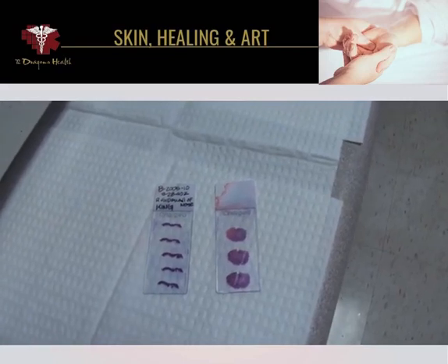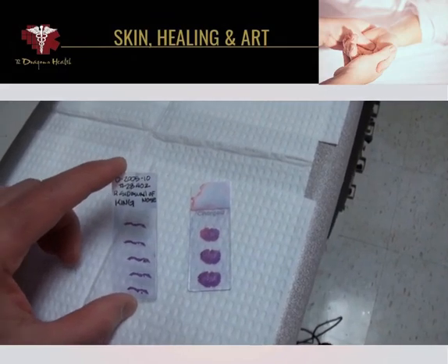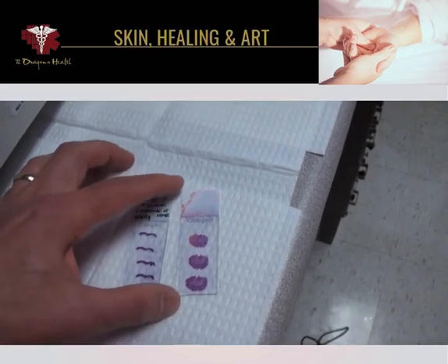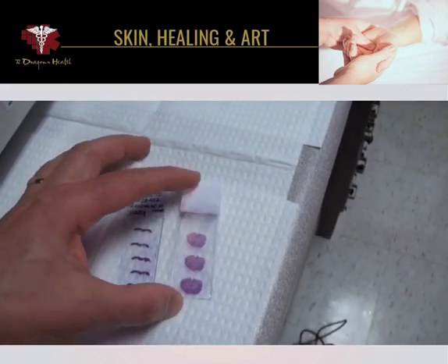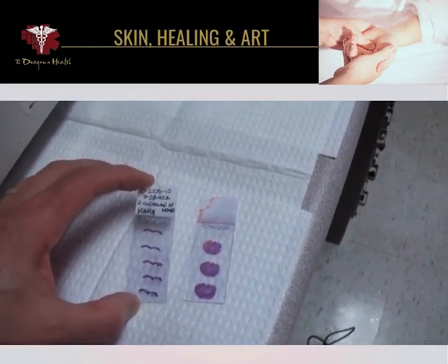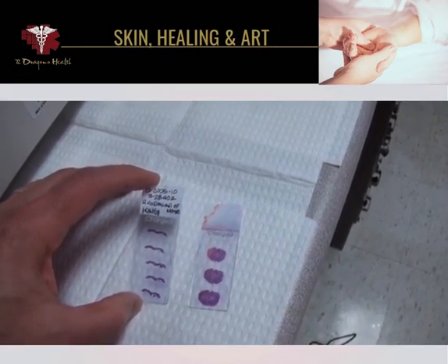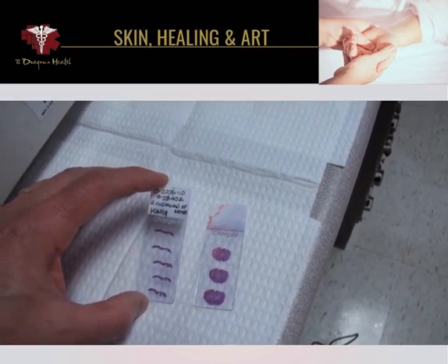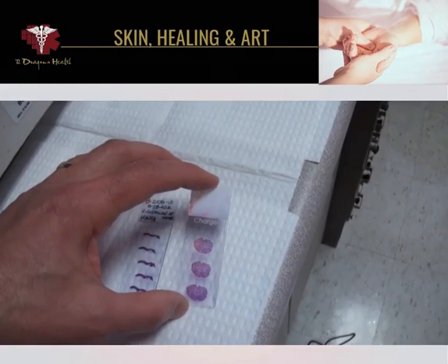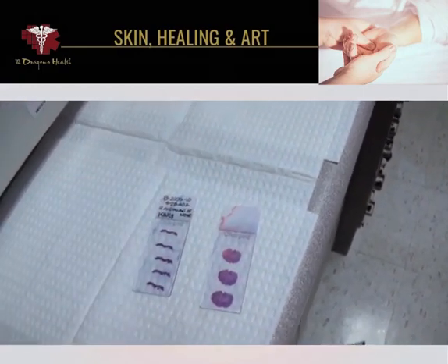This shows the difference between the standard vertical sections, where you have a relatively small amount of tissue that is processed, versus a horizontal section that shows a much greater surface area. In this case, the tissue is simply cut like a bread loaf, and you have a small section where you're seeing the skin and the dermis, but you're not seeing the entire specimen or the entire undersurface as you see here in this round disc-like specimen.